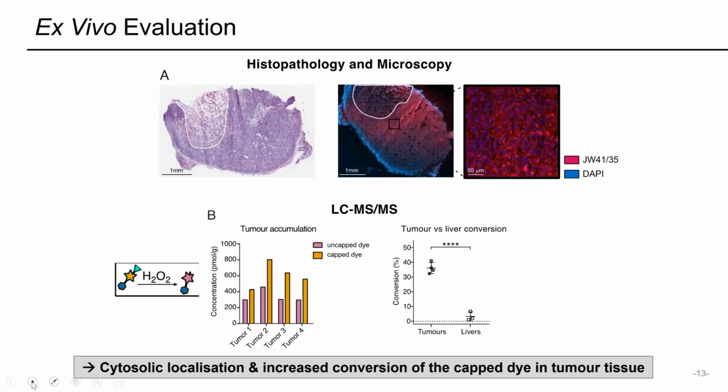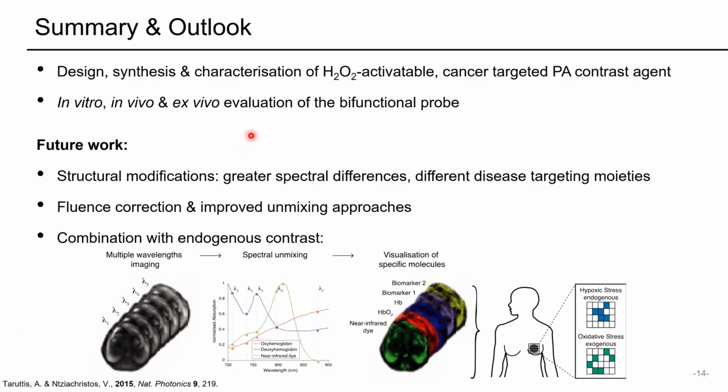So to summarize the work, we have designed, synthesized, and characterized a hydrogen peroxide activatable contrast agent for photoacoustic imaging, and have evaluated it in vitro, in vivo, as well as ex vivo.